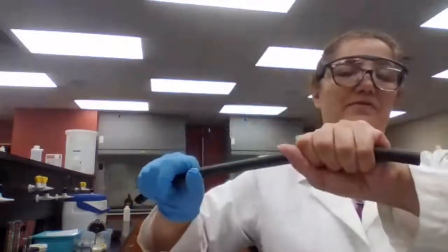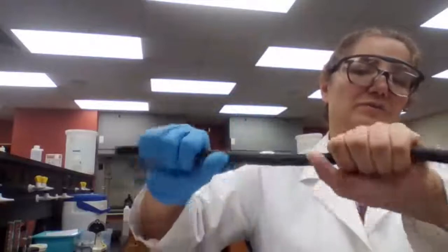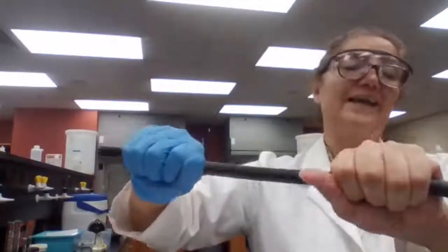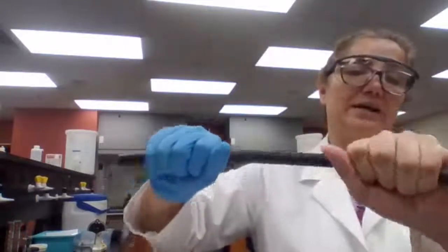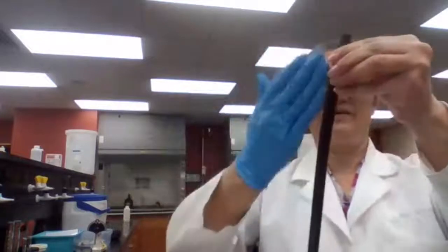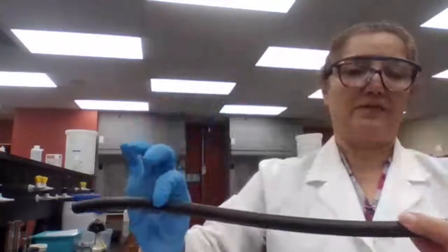Both are strong, both are good, and the surface contact area is the same for both the right hand and the left hand. Why? Because this has a plane of symmetry and is not a chiral compound. Because it's not chiral, the product is going to be the same. The bonding is going to be the same.